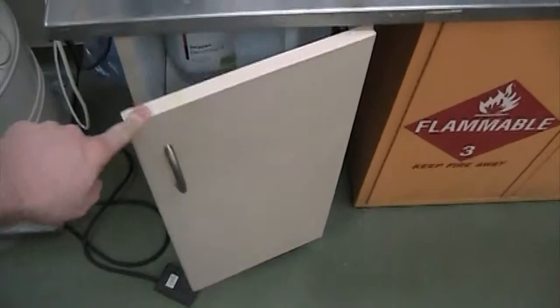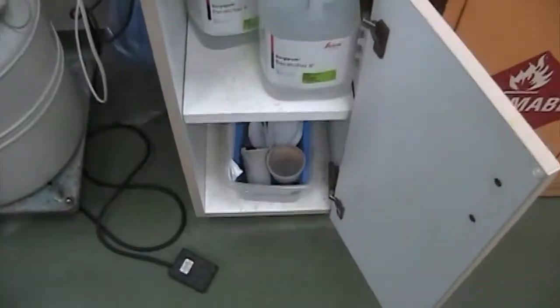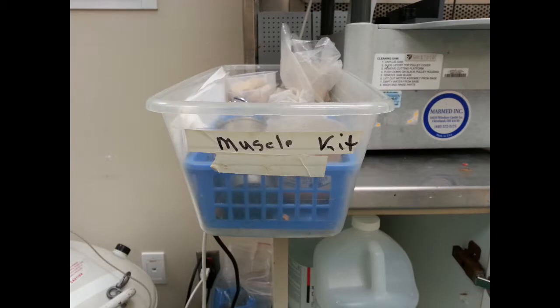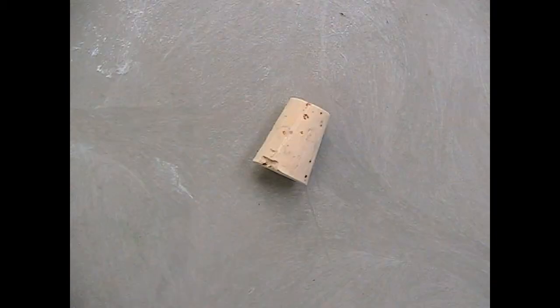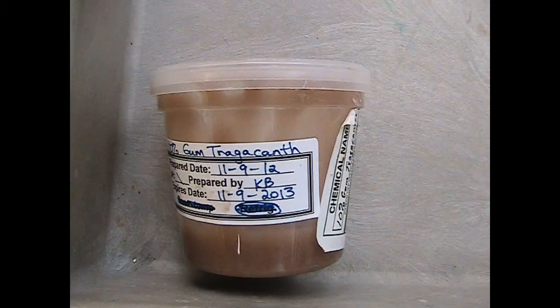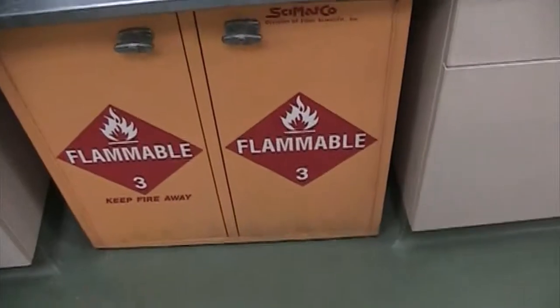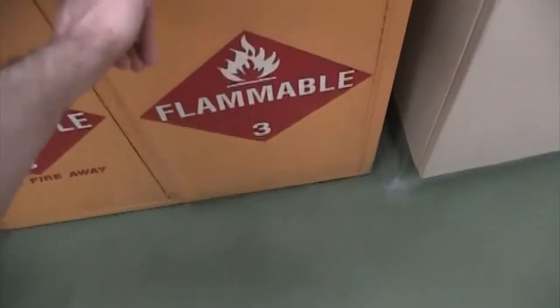tissue. In the cupboard beneath the bone saw, there will be a liquid nitrogen container and the muscle kit. Within the kit, there should be a pencil, some cork, gum tragacanth, metal spatula, and the 2-methylbutane container with attached hemostat. Adjacent to the cupboard in the flammable items locker is the 2-methylbutane.